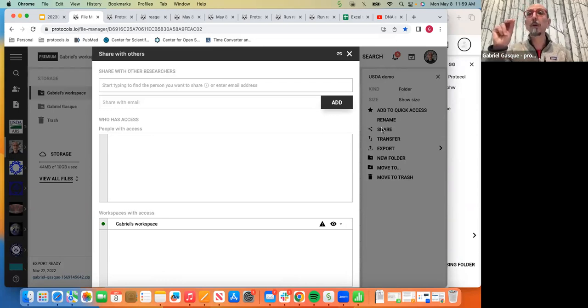So if you share a protocol or you share a folder, you are only sharing that folder or that protocol. You are not bringing people to the workspace, and they will not have access to any other document that is in that workspace. And as I showed you before, you can control what these people can do with what you are sharing. You can make them only viewers or viewers and editors, or viewers and editors and publishers.